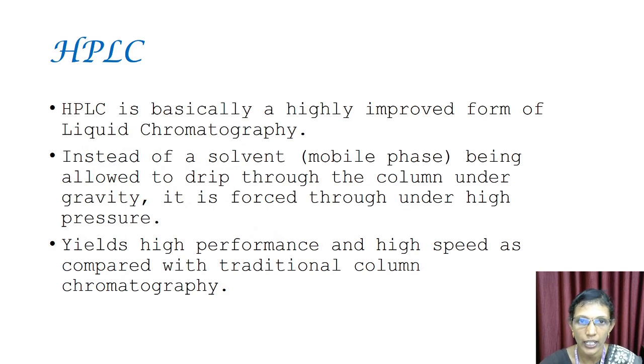The next one is HPLC. HPLC stands for high performance liquid chromatography. In liquid chromatography the mobile phase acts as a solvent, but here, instead of the solvent alone, high pressures are used. So HPLC is basically an improved form of liquid chromatography.